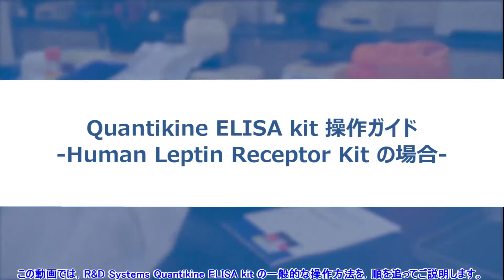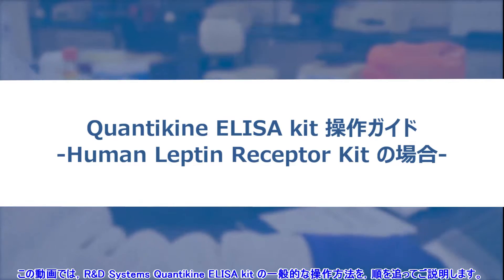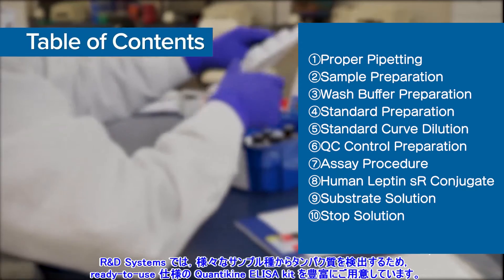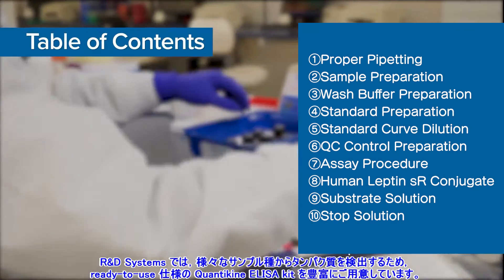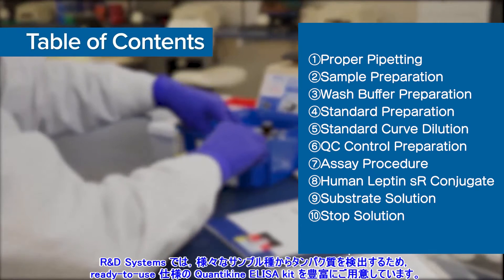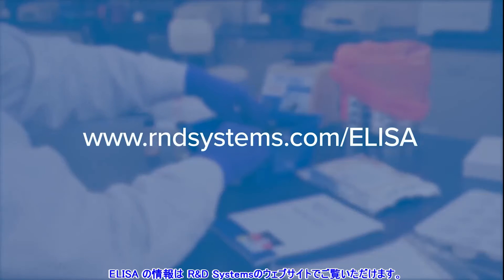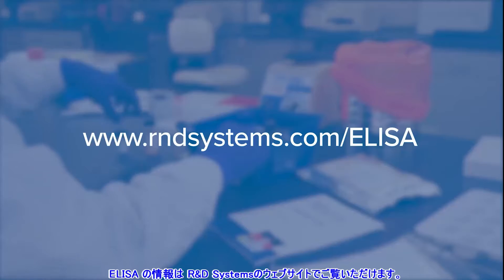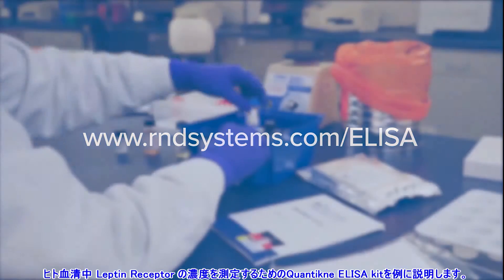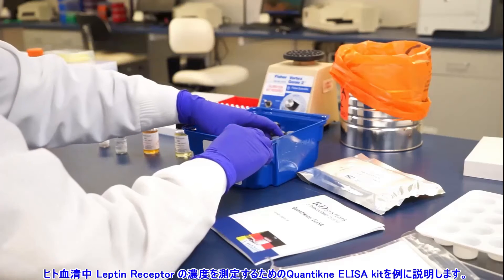This video is a general step-by-step guide for running an R&D Systems Quantikine ELISA kit. R&D Systems offers many ready-to-use Quantikine ELISA kits for the detection of proteins in various sample types. ELISA information is available at rndsystems.com/ELISA. In this video, we are running a Quantikine ELISA kit to determine human leptin receptor concentrations in serum.